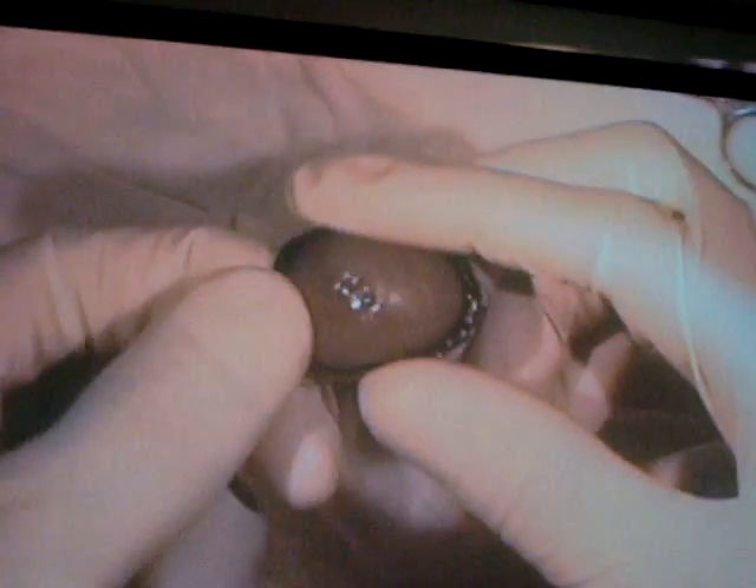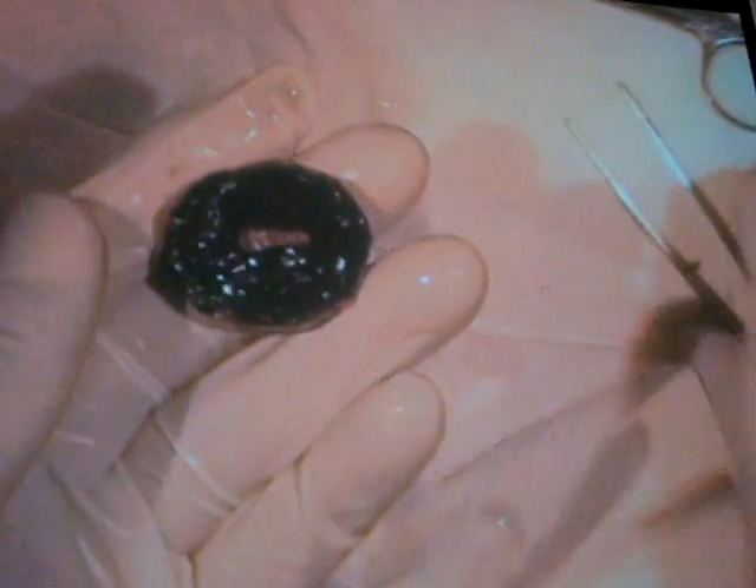Now that I've cut through, I can make one more snip. That's not blood — it's jelly. This is the cow's eye, and this right here is the cornea. Let's take a look behind the cornea and see what's on the inside.